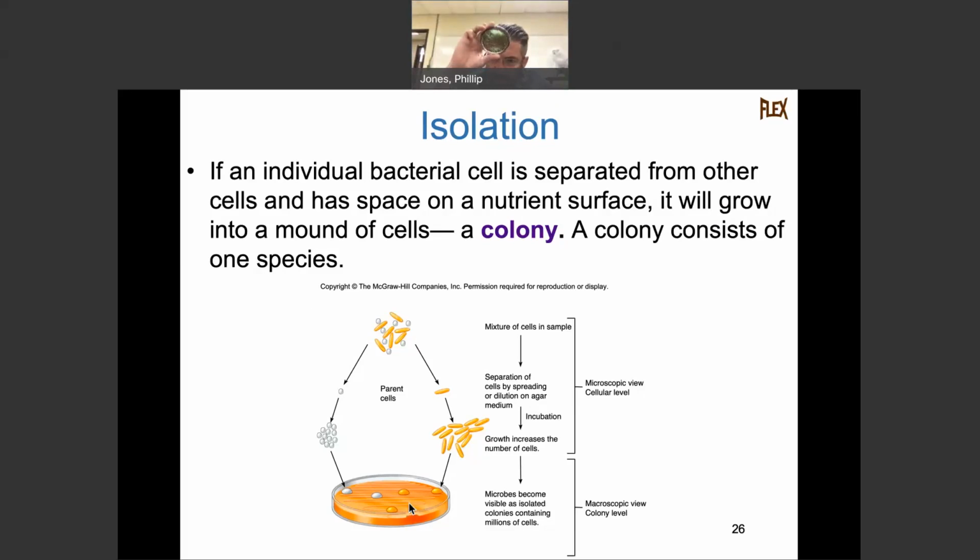I'm going to hit the light right. So if you can see, that has a really cool sheen, and it was actually even better Tuesday, because I couldn't get this E. coli to grow, which is really irritating because E. coli grows everywhere, but I couldn't. It was the slowest, most sluggish E. coli I've ever seen, but I got it to grow, and I proved that it was E. coli, a lactose fermenter anyway, by that sheen.